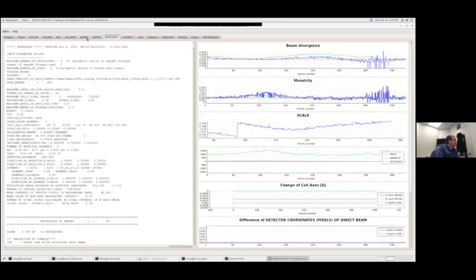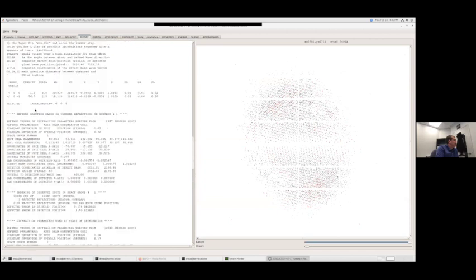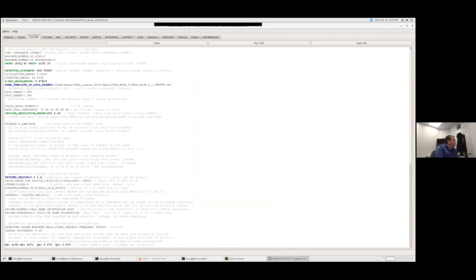We checked that on the IDXREF when we looked at this table here, the selection of the index origin. If I wanted to change the beam center because those values are off, then I can make that change here. And in this case, I would probably rerun the IDXREF, DEFPIX, integrate, and correct.